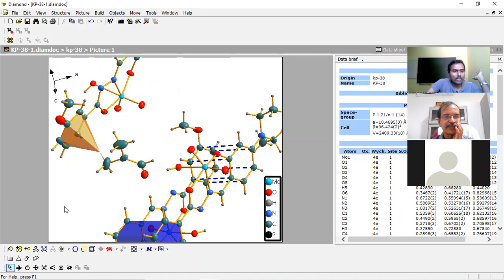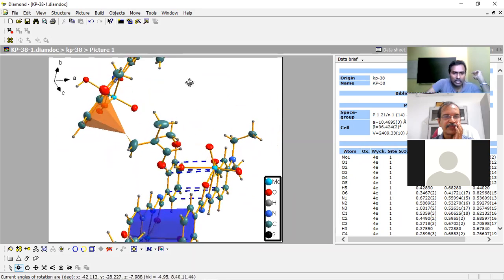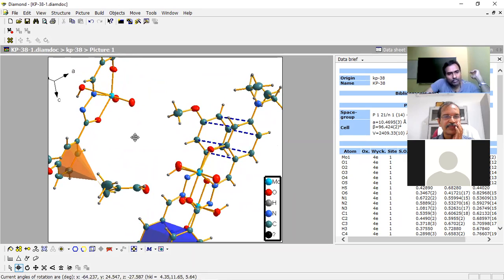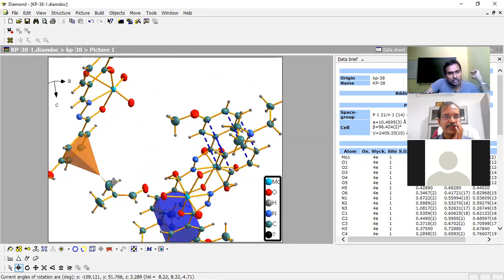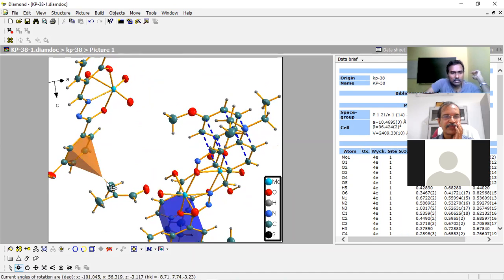Okay. This atom is visible because we have given 50% transparency. Therefore, you can see the other atoms behind. This is not the dummy atom. So this is the atom here. So you cannot see any dummy atom here. So this is how we can draw the solid representation to show the CH pi interaction.